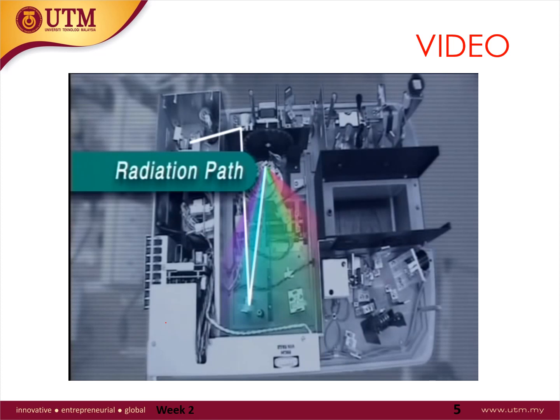A single wavelength passes into the modulator, which consists of a rotor with mirrors on it. This chops the light into two beams. One beam passes through the sample cell, while the other passes through the reference cell. So the instrument is referred to as a double beam instrument. Both sample and reference beams are directed by mirrors onto a detector. This compares their intensities and sends a signal proportional to the ratio of their intensities to the computer that controls the instrument. The logarithm of this ratio gives a quantity called absorbance, which is a measure of how much light is being absorbed by the sample at that particular wavelength.